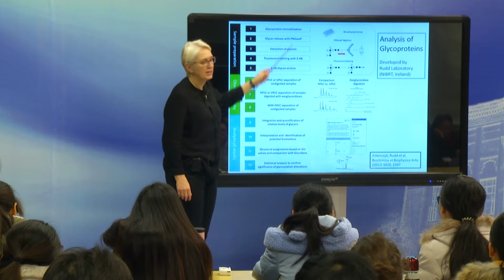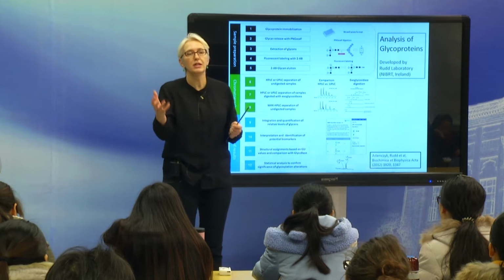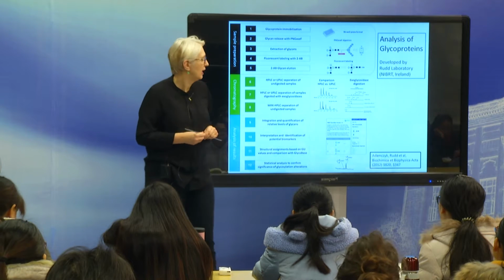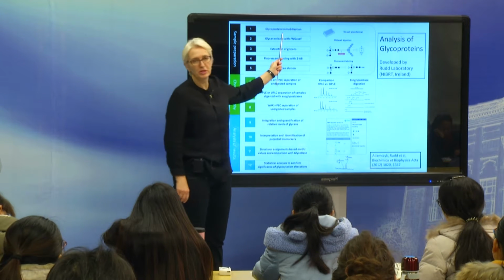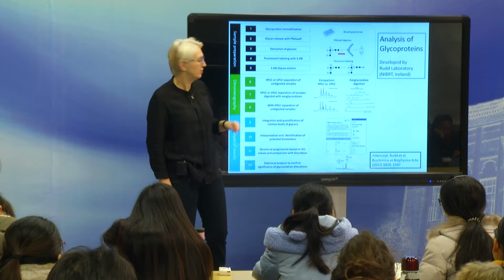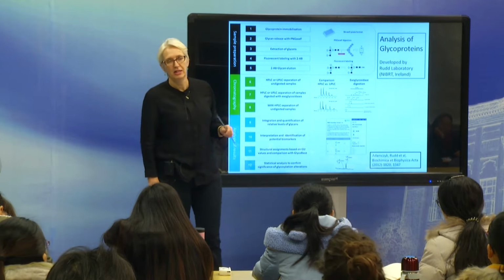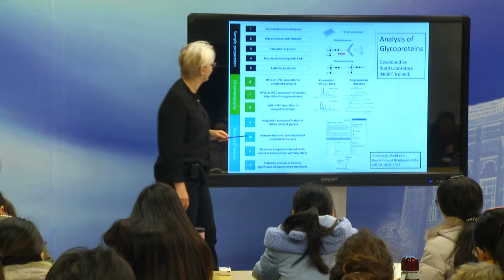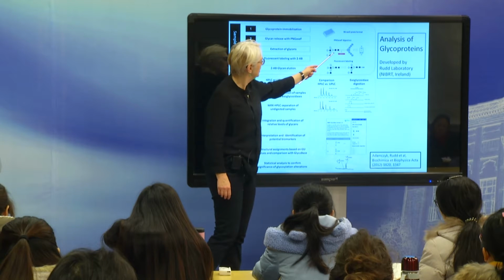Then you need to get the glycans off the protein. So you want to analyze what glycans are on the protein. And you do this with an enzyme, which again, in Professor Vogelmeier's group here, I think some of you will be working with, called PNGase-F. Very expensive enzyme actually, so it's good to have a good expression system. And what that does, it just cleaves all these N-glycans.